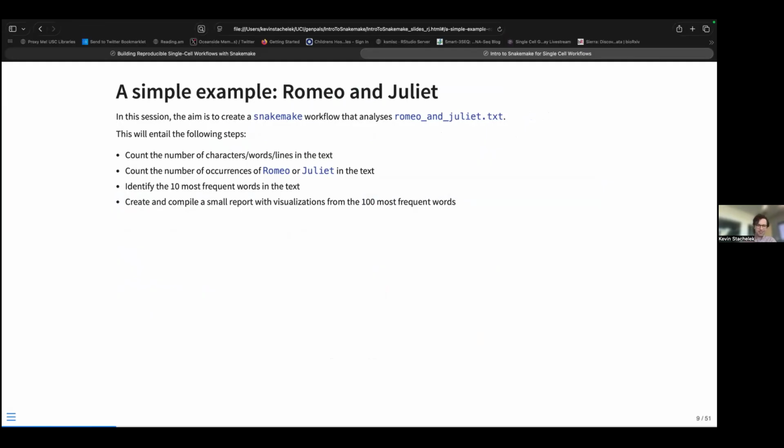It's fairly easy to keep track of what's going on, and we can state the analysis in simple words instead of using a lot of terms that people may not be familiar with.